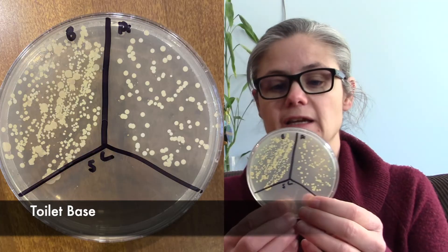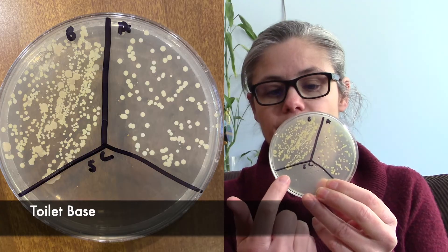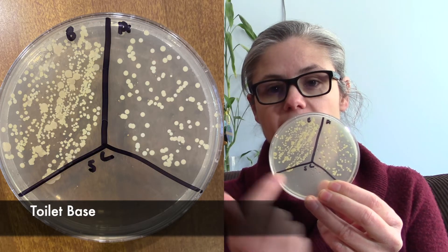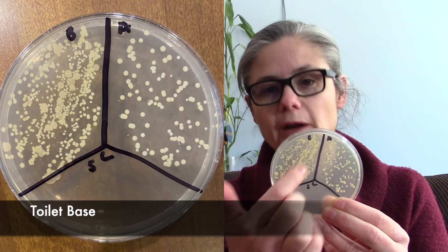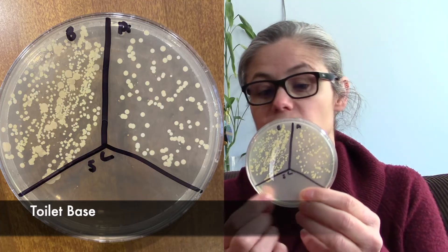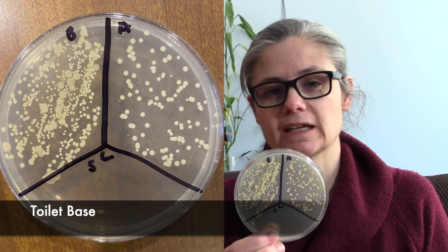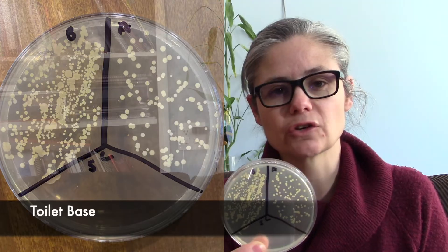The toilet base. So again, we can see B for before. We do have a lot of bacterial growth. And I did by accident cross the line here into the control area, so that was a mistake on my behalf. But you can see it was clearly from what I was doing when I was swabbing back and forth. That was an error — it's just good to point it out. And you can see the A for after side. There's less. But again, I wouldn't say it's a significant amount to say it does an excellent job of cleaning. It does a so-so job of cleaning my bathroom toilet base.